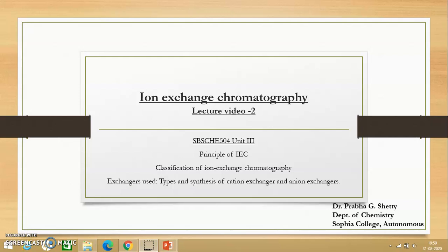This is the second video on ion exchange chromatography. It is from paper 4 and unit 3. What you will see in this video is the principle of ion exchange chromatography, classification of ion exchange chromatography, and the types of exchanger used, their synthesis and the conditions under which you are supposed to use these exchangers.